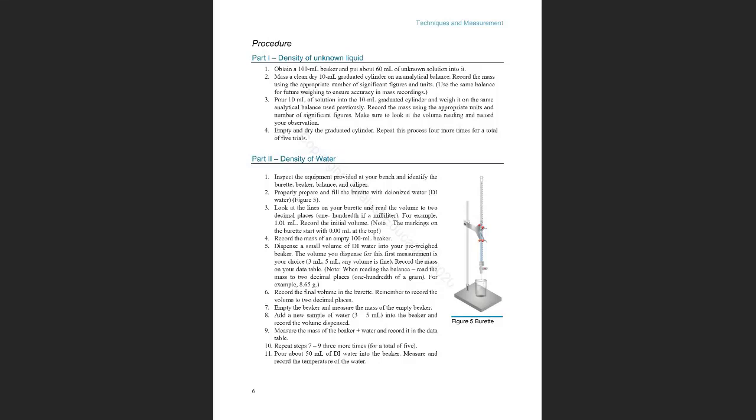Here, basically, what you are doing, part one, you are going to calculate the density of an unknown. It happens that you're going to use water both times, but what is the difference? Here, you are going to measure.